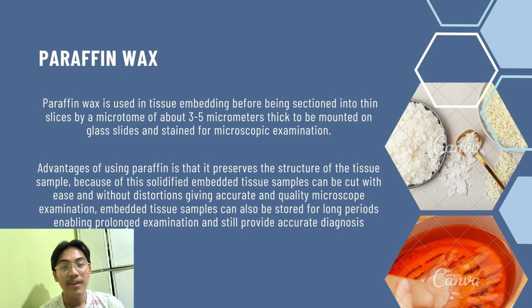Because of this, solidified embedded tissue samples can be cut with ease and without distortions, giving accurate and quality microscope examinations. Embedded tissue samples can also be stored for long periods, enabling prolonged examination and still provide accurate diagnosis.